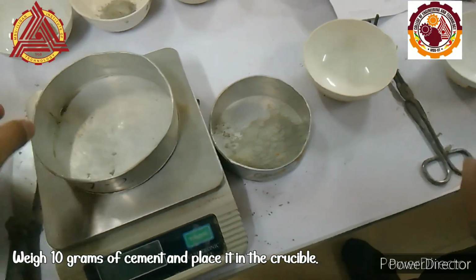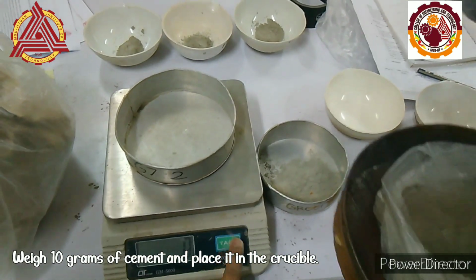Second, weigh 10 grams of cement and place it in the empty crucible.